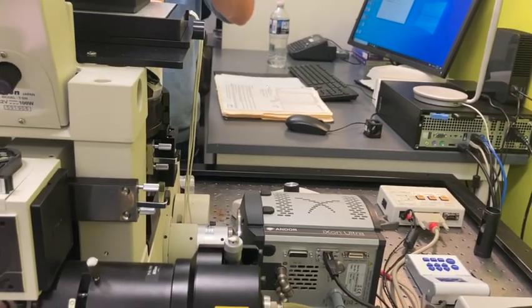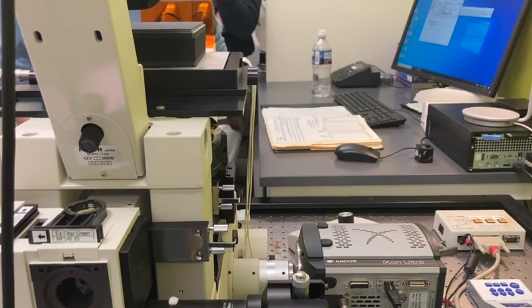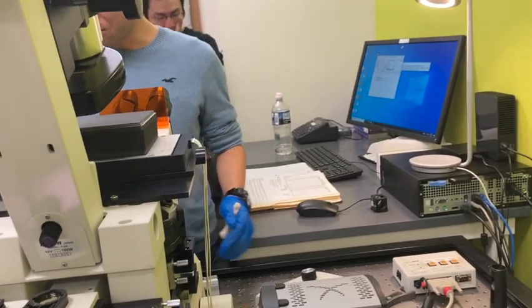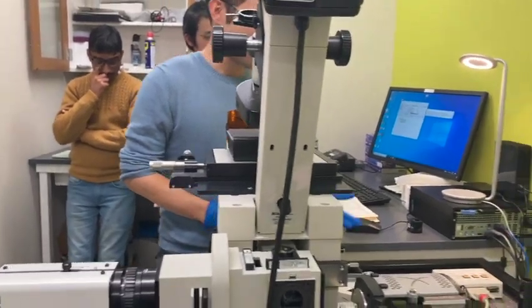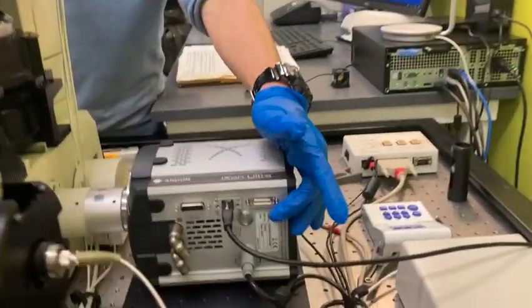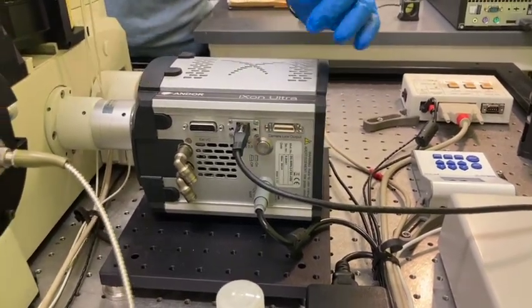That's the time you're going to clean up the objective, remove anything you brought in, and save all the videos. That'll take more than 5 minutes anyway. Then you can turn it off. There's a button here. I can feel it with my glove on top.